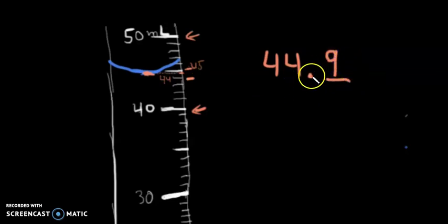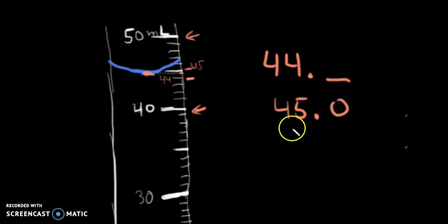44.9 means almost 45, right? Maybe somebody else sees this and says, well, it's not that close to 45, maybe 44.8 might be more accurate. Well, that's also fine. But we know that we're in the realm of almost 45. And even then, another person can look at this and say, hey, that's not 44.9, that is 45 exactly. And these are all fine because they are pretty close to whatever this line is falling on.